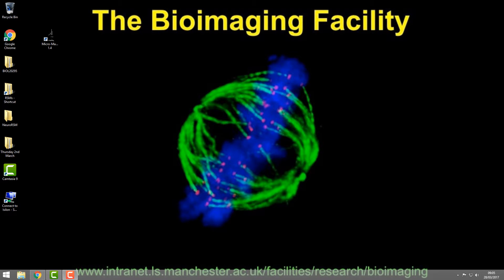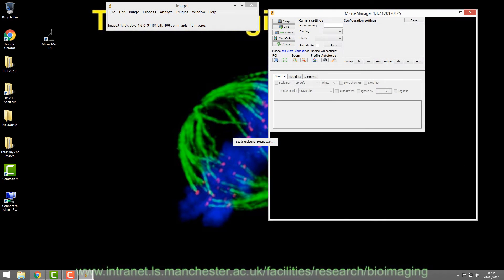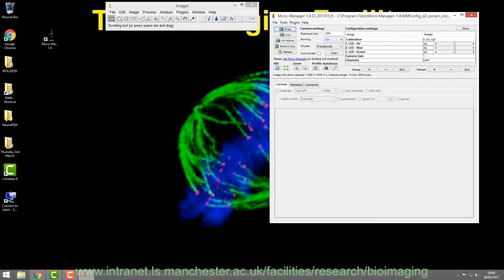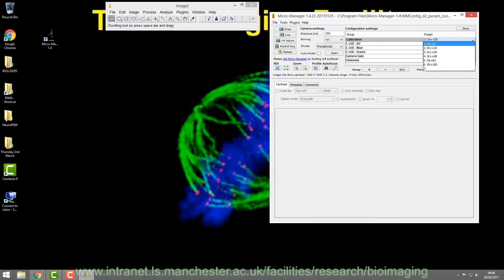We are now moving over to MicroManager. The advantage is that the software controls the acquisition and the filter wheel, so not only do you get to choose the exposure times, but it'll capture a sequence so you don't have to remember exposure times between different slides. When you launch MicroManager, this is the window you see. You can tell it what objective you're using and that applies the calibration, but it doesn't change the actual objective — you have to do that manually.